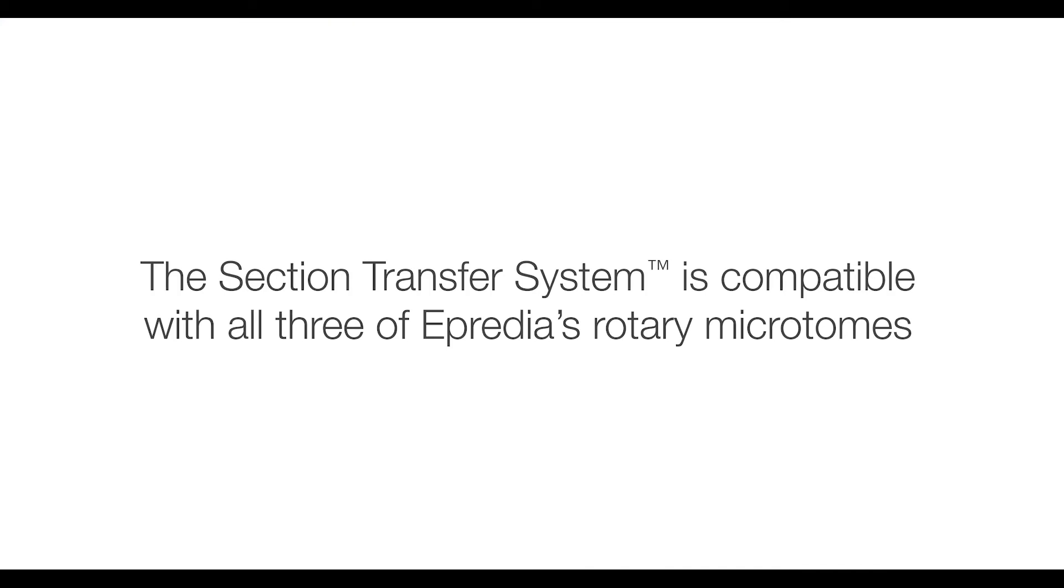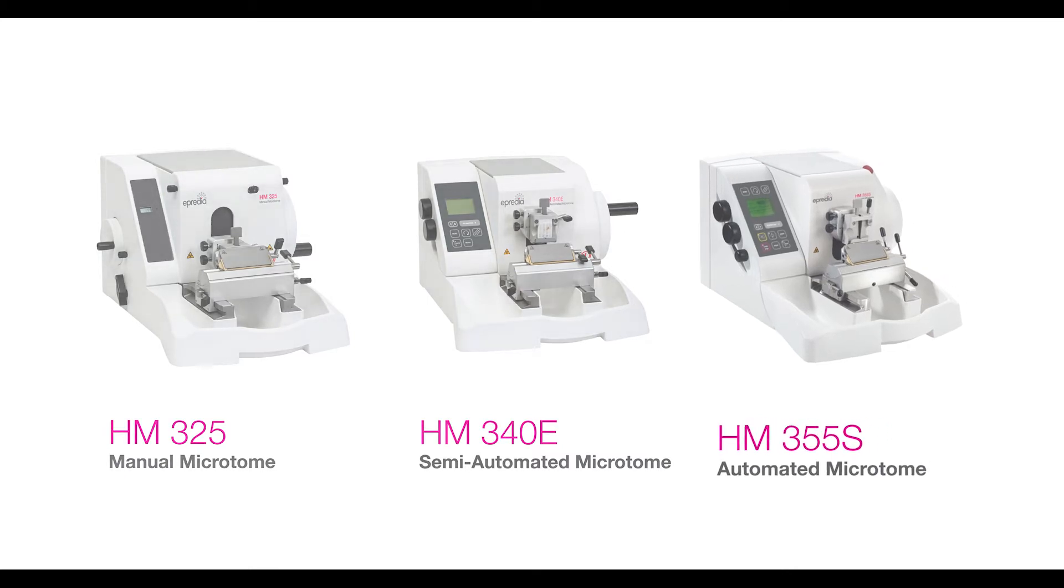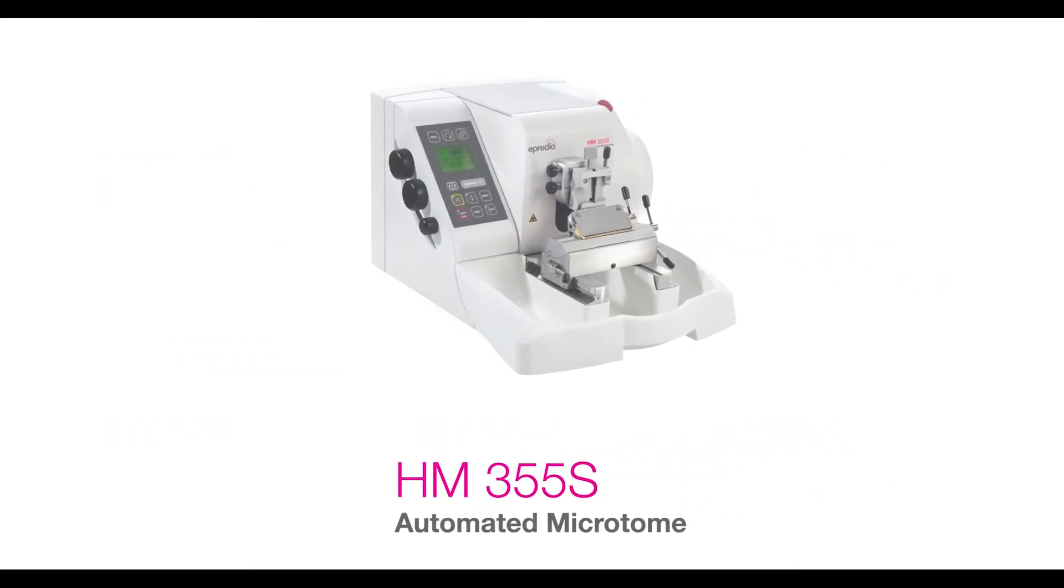The section transfer system is compatible with all three of Epredia's rotary microtomes: the HM325, the HM340E, and the HM355S. Here it's being demonstrated on the HM355S.